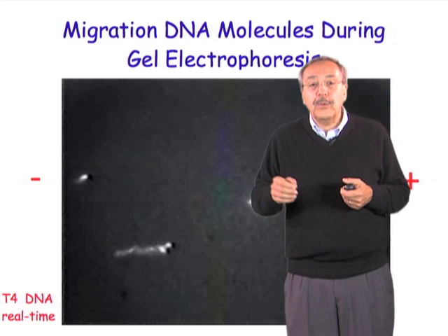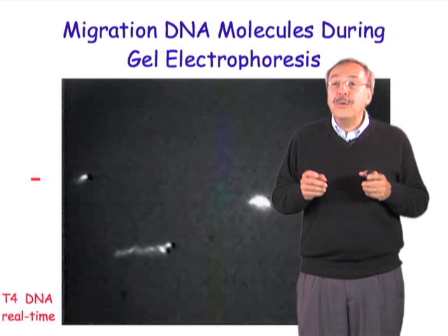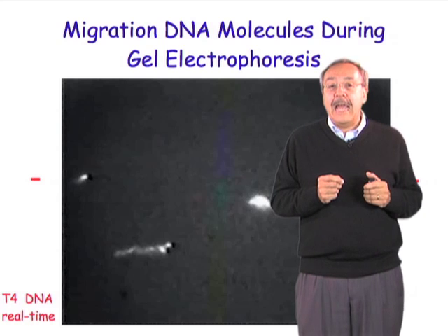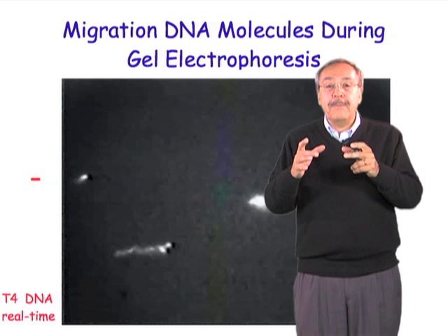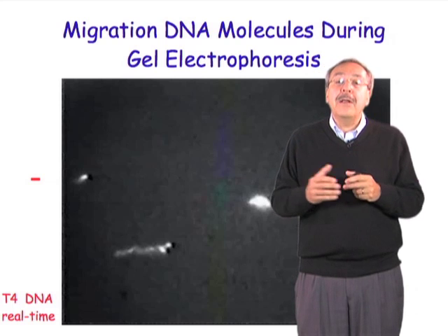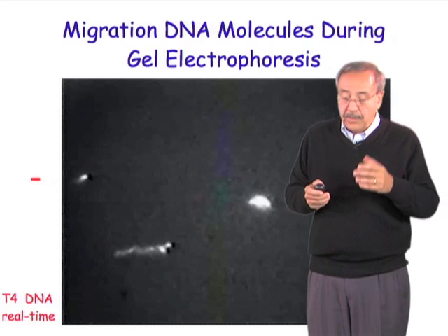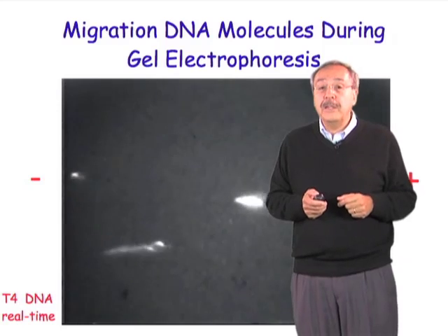It is always good to actually have some nail polish around in the laboratory. And then we applied 2 electrodes on both sides of the slide, and we look at this slide cover slip type of chamber under a fluorescence microscope, an optical fluorescence microscope. And what you see is, what we saw, is what you see in this movie.